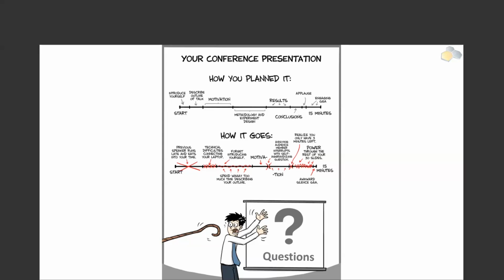Which brings me to the next question, actually. The next question is, would identification of DVGs effectively lower the percentage of SNVs? Well, I guess that's the hypothesis, right? That's what we're claiming, that some of these mutations can be coming from falsely mapped reads due to DVGs.